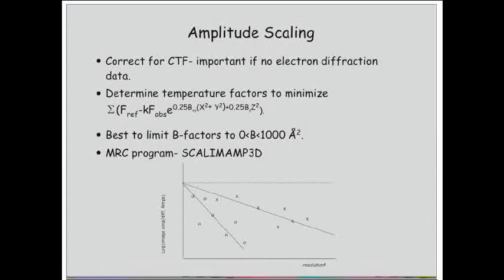Now, I'm only talking about images, and not always do we have the luxury of having well-measured electron diffraction amplitudes, so we're going to have to get amplitudes from the images. And those amplitudes are typically rather badly measured for various reasons.